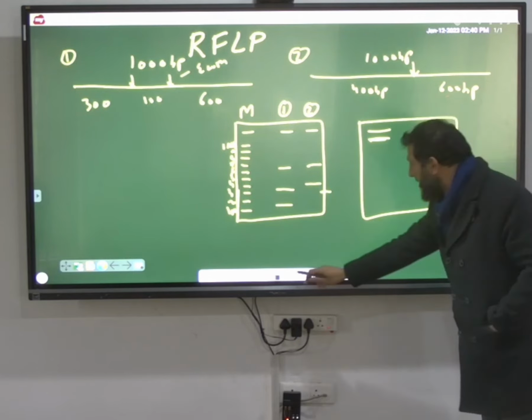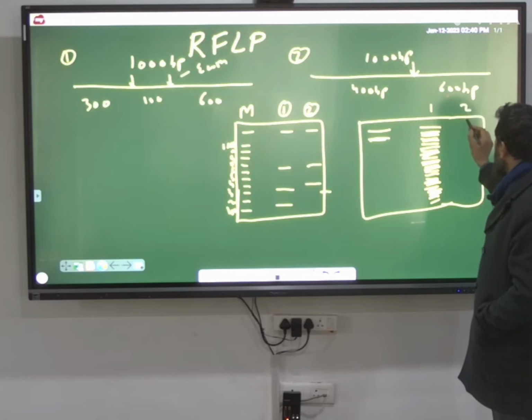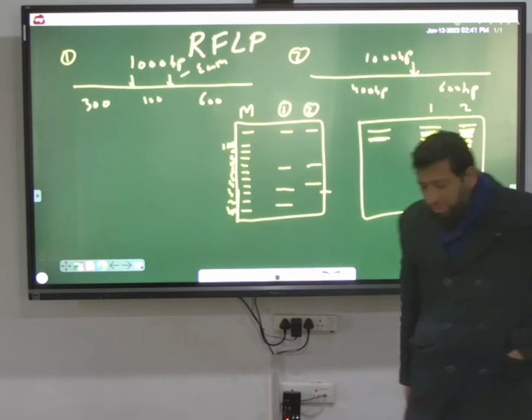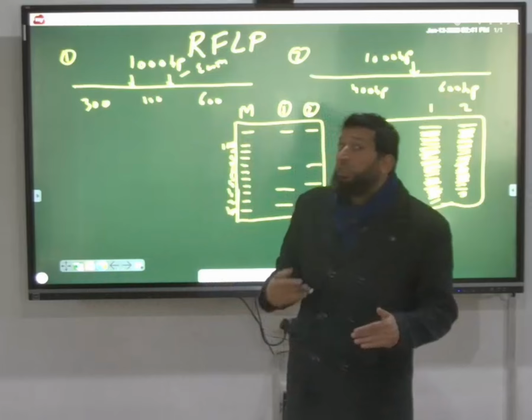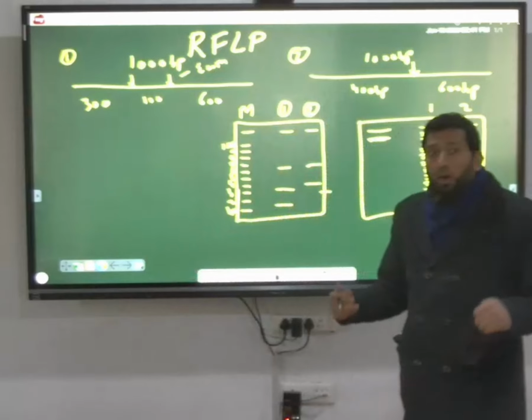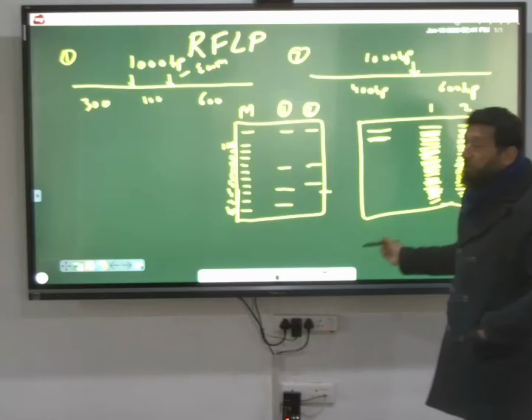In this case, case 1 and case 2, when you did this, you will again get a smear. So by restriction digesting the 2 DNAs, when you run them on a gel, you do not see the difference. What I told you was the concept, that is what happens actually. But this you will not be able to detect on a gel. So now how can you detect it on a gel? What we do once we run this gel is we use a technique we call southern blotting.